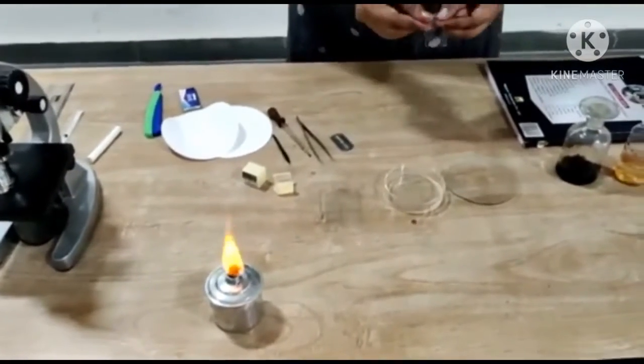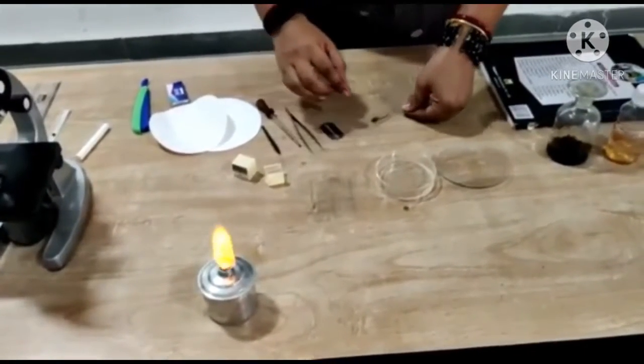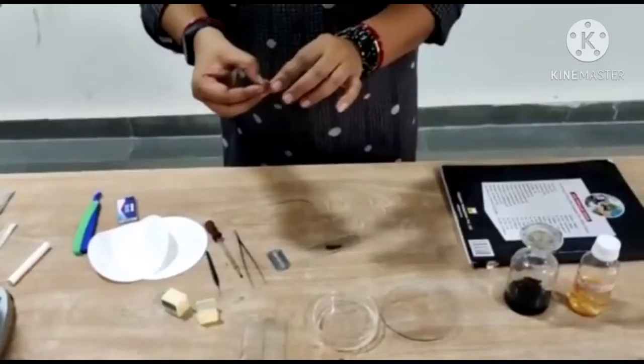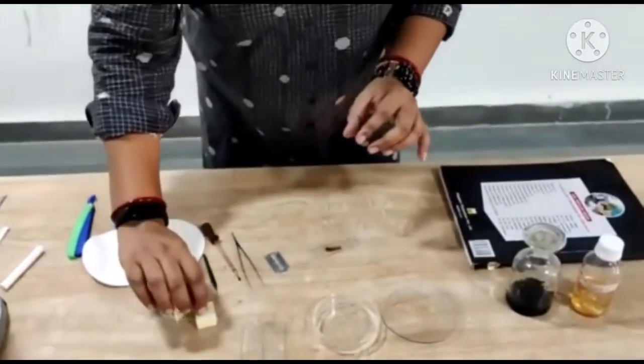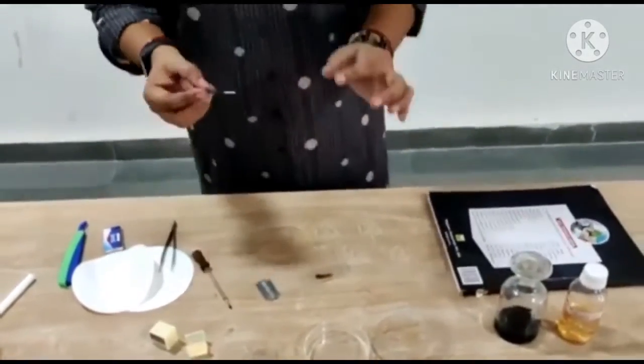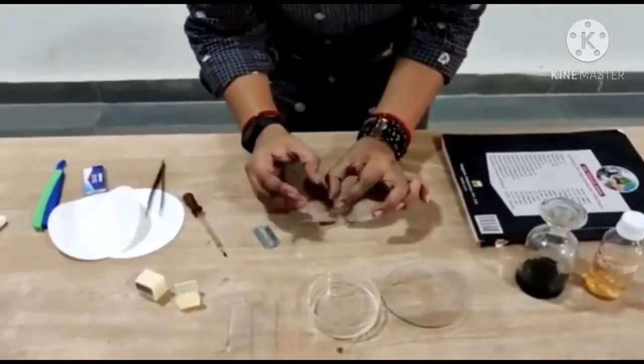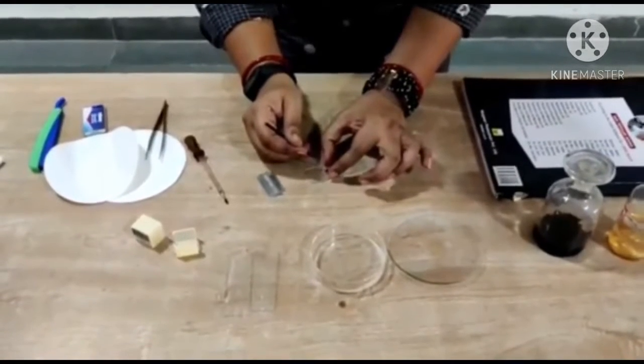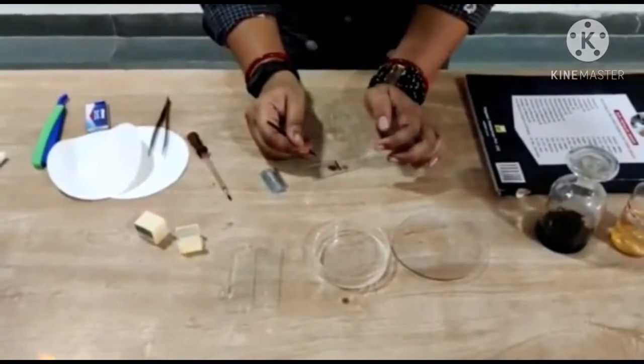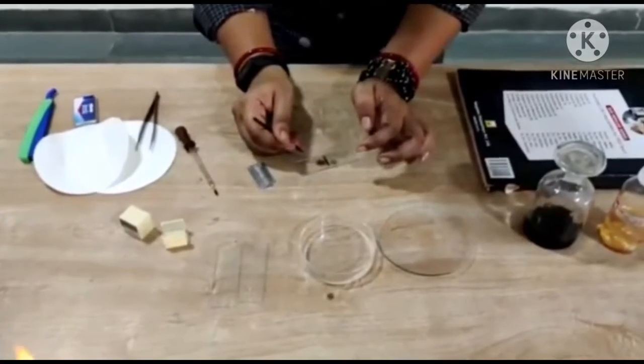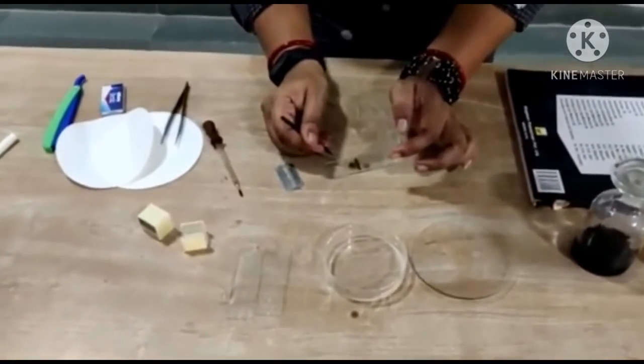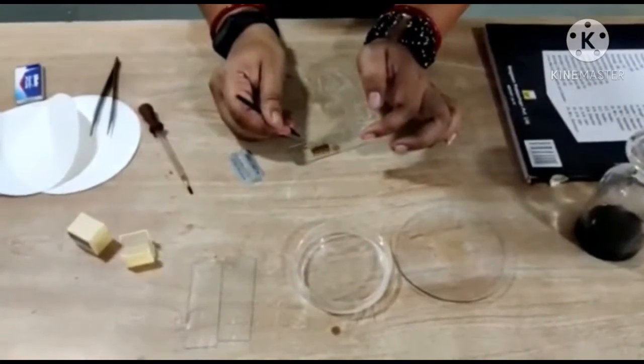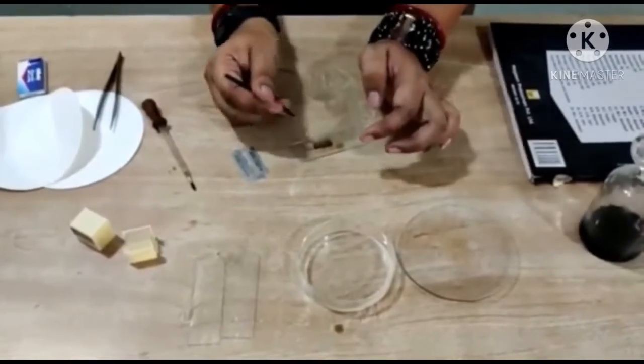After warming up, we will put the cover slip very gently. For putting the cover slip, you should take help of a needle. We will put the cover slip just on the material very slowly to avoid the air bubbles.